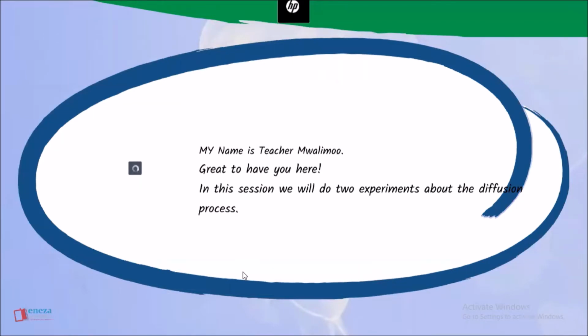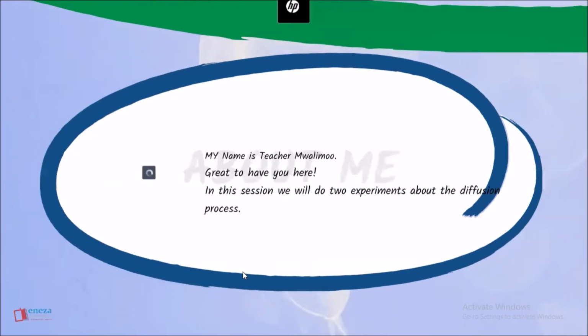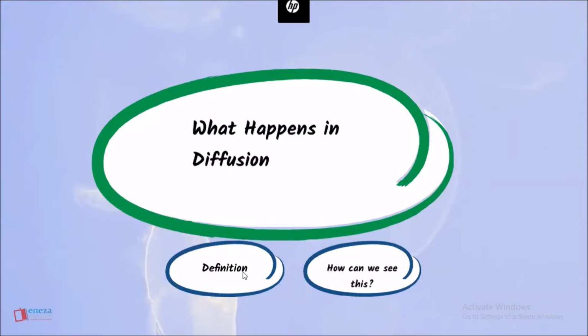In this session, we will do 2 experiments about the diffusion process. What happens in diffusion? We'll start with a brief definition of what diffusion is.